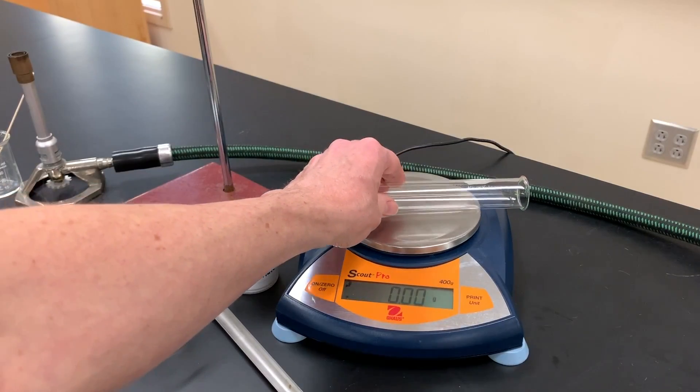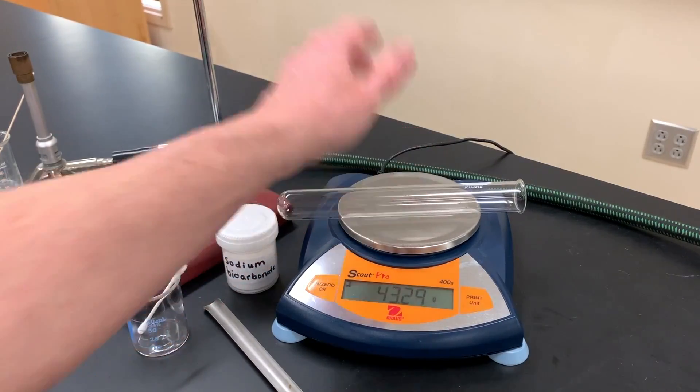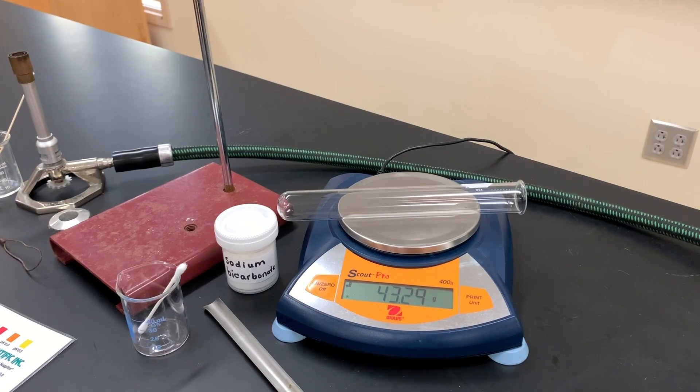Mine doesn't roll off so I'm able to put the test tube directly on there. Make sure right now that you record 43.29 grams in your data table as your test tube's mass.